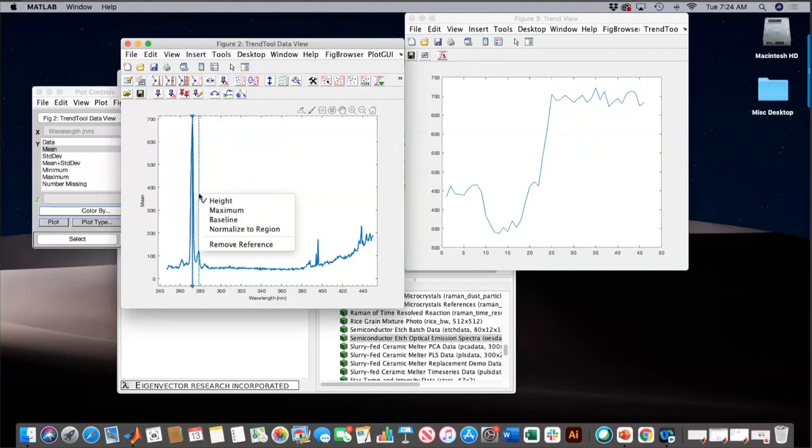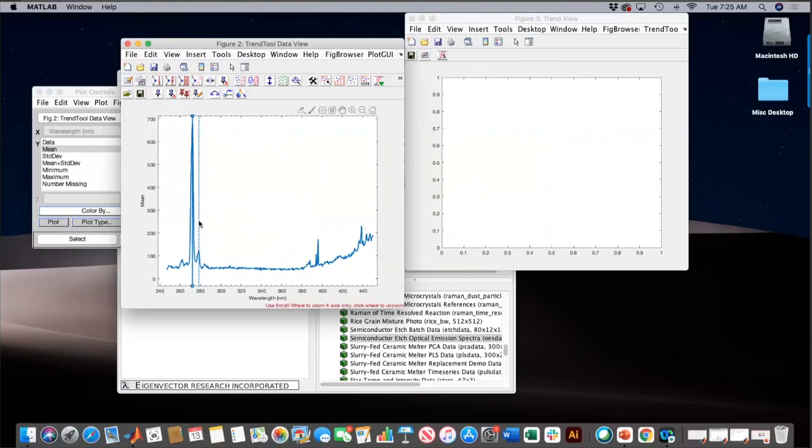And let me see. Yeah, that was not what I wanted. And so in fact, that's really that with that subtracted off. Now to do ratio, I think there's a way to do ratio. I don't remember what it is. Hey, Bob, if you remember that, let me know. But I tell you what, we'll look at that one.